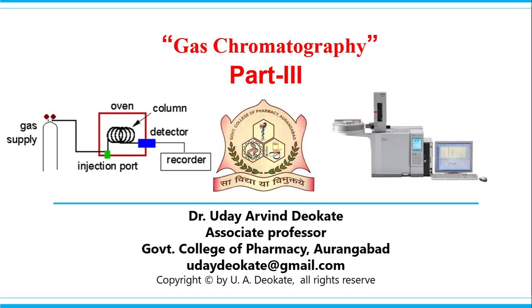In the first part, we studied the basic principle of gas chromatography. Then in the second part, we started with the instrumentation. In instrumentation, we studied the various carrier gases we use in gas chromatography. Then we studied the gas control panels. Then the various methods by which the sample injection is done.